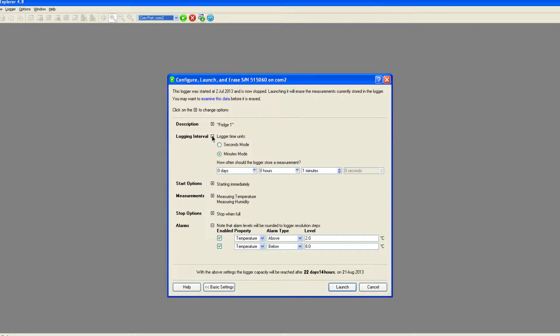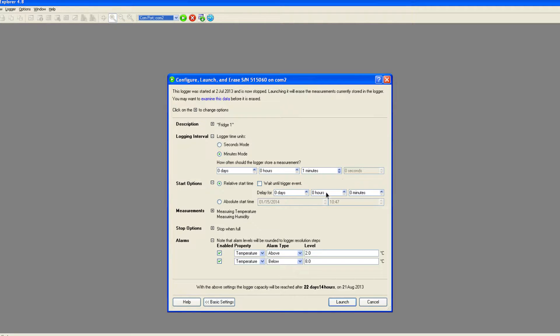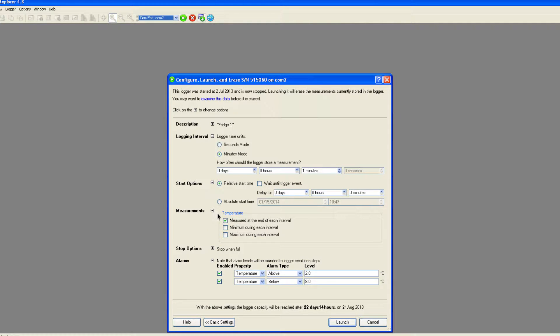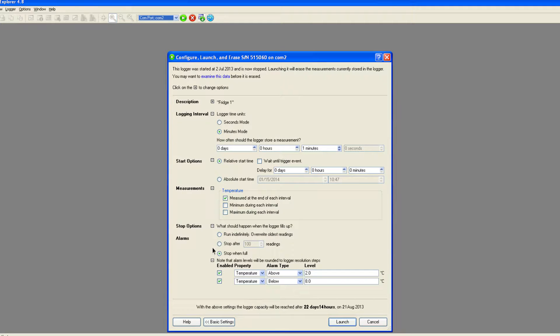Here you can delay the start of the recording until a specified time, record maximum and minimum readings during the logging period, select options for stopping recording and set an alarm indication if readings fall outside a user defined range.